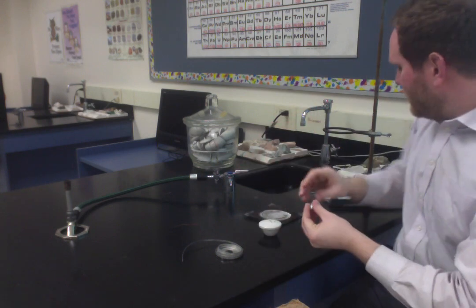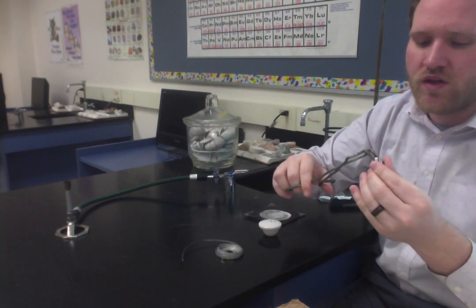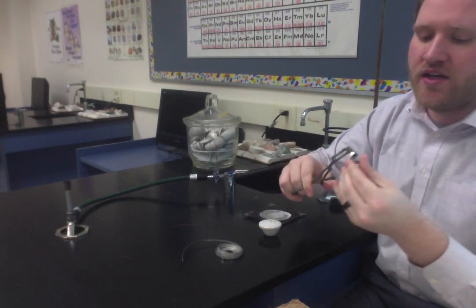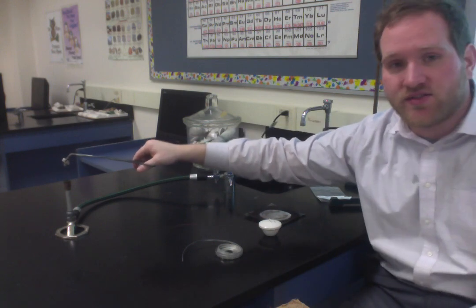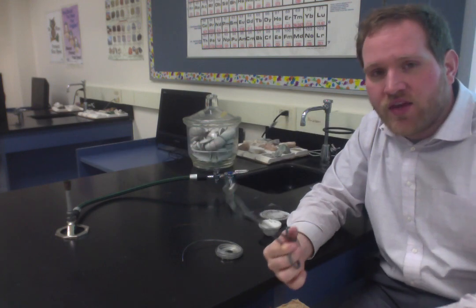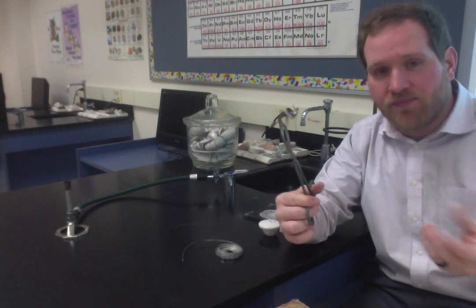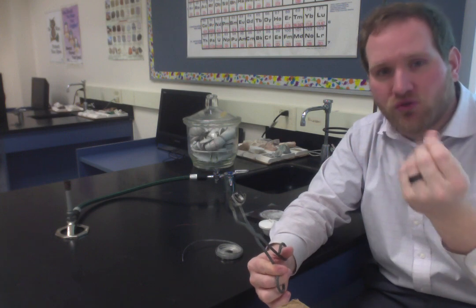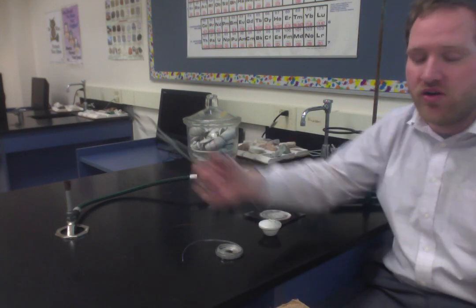If you just took this, held it in these crucible tongs, and put it in the Bunsen burner flame, it would burn very fast. Within a few seconds, you would have magnesium oxide. But the problem is magnesium oxide has very different properties from magnesium. Magnesium oxide is a kind of powdery solid, and it would crumble and fall apart.